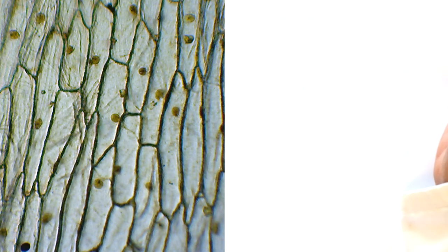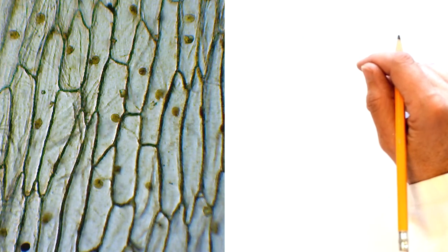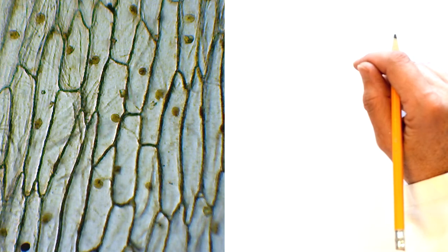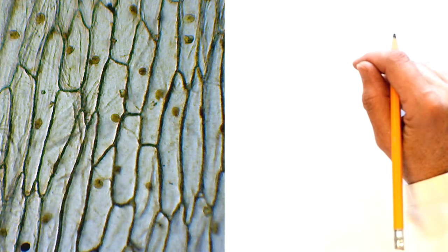So can you look down the microscope, see something, make genuine observations about what it is you were seeing and then commit them to paper to show that you've thought about what you are actually seeing.